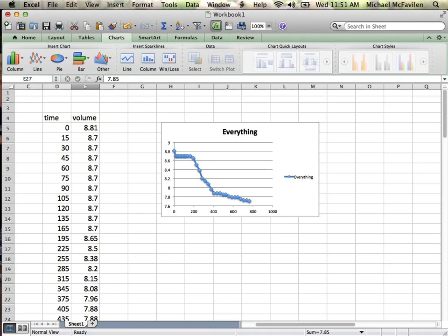This is one of the big reasons we use leading zeros. If you take a closer look at those pipettes, there is a decimal point before all of those numbers. Okay. It's not going to change any of the fits necessarily, but it is going to change your change in mass, or change in volume, because you're now saying milliliters when really it's not milliliters. It's a fraction of a milliliter. So we should change all those numbers, shift that decimal point over.